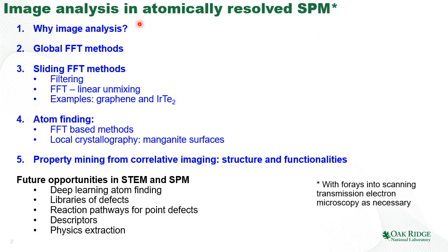So in this lecture, we are going to discuss why we need to analyze images in scanning probe and electron microscopy in the first place. What can we hope to learn out of precise image analytics? We are going to briefly discuss the methods based on the global Fourier transform and introduce the methods based on the Fourier transform in the sliding window, so-called sliding FFT.